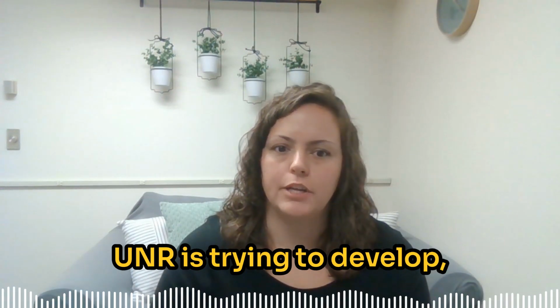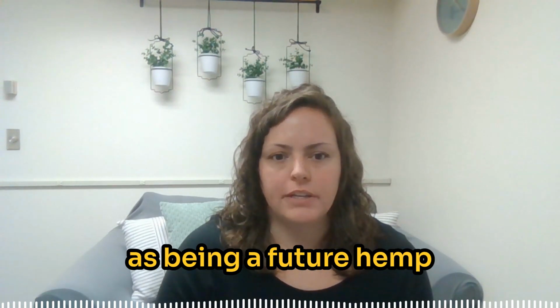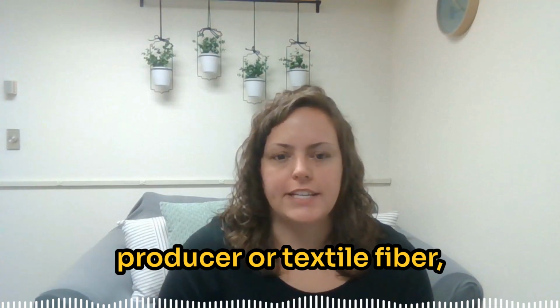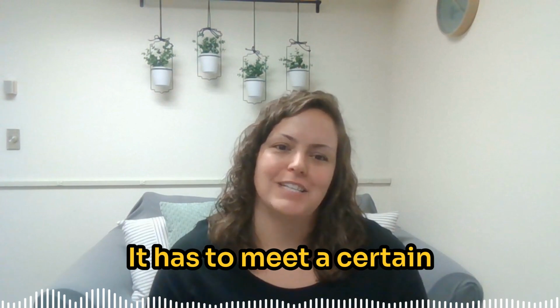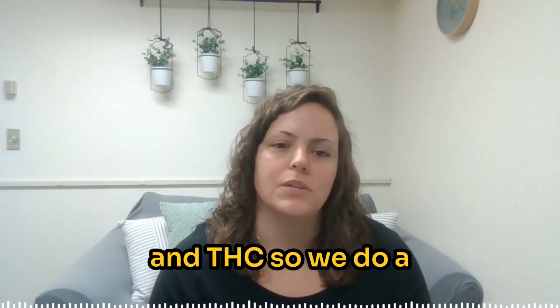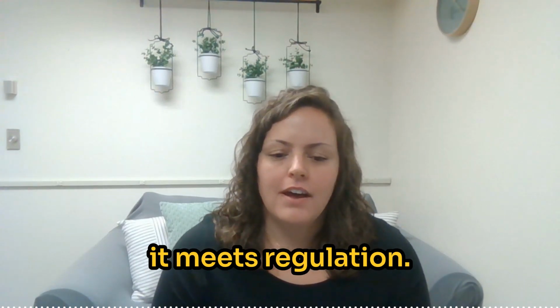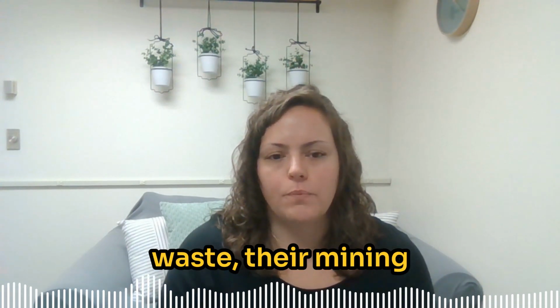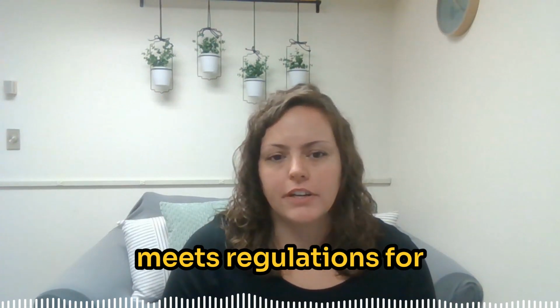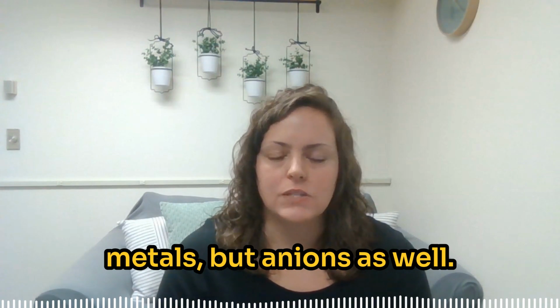UNR is trying to develop and genetically modify hemp to have Nevada as a future hemp producer for textile fiber. But in order for it to be sold as hemp, right, it has to meet a certain threshold for CBD and THC. So we do a lot of testing on that material to make sure it meets regulation. We've done quite a bit of work with mining industries in the West, looking at their mining waste to make sure it meets regulations for contaminants, not only metals, but anions as well.